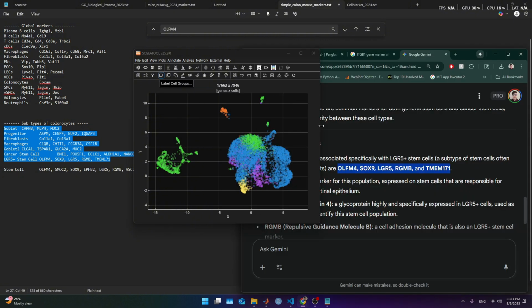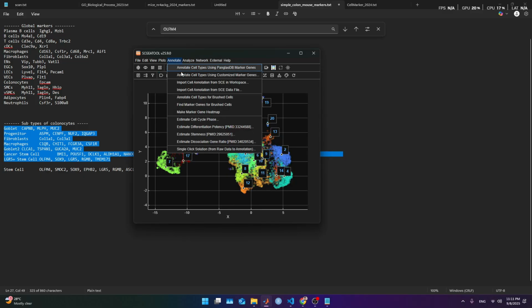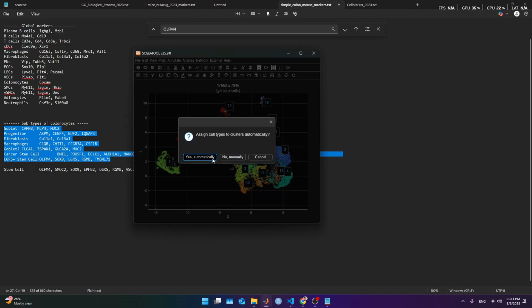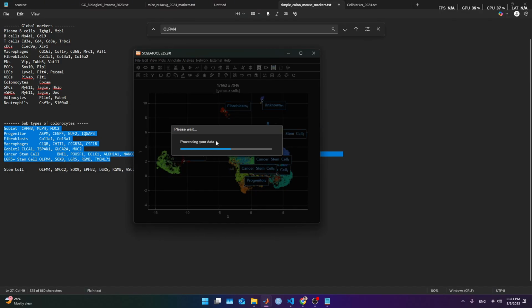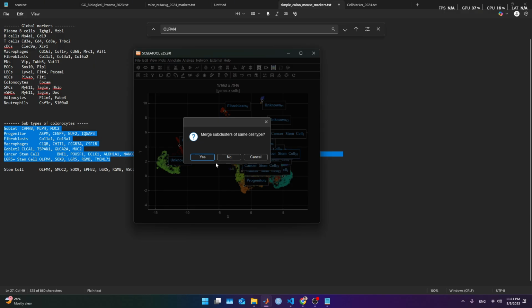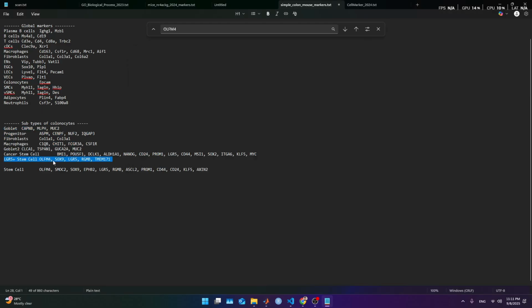Cluster ID, and annotate again. Let it be. Now it has less stem cell markers and should confound the sample less, and it classified as a stem cell progenitor. So we are not getting the stem cells. So the LGR5 is not helping.